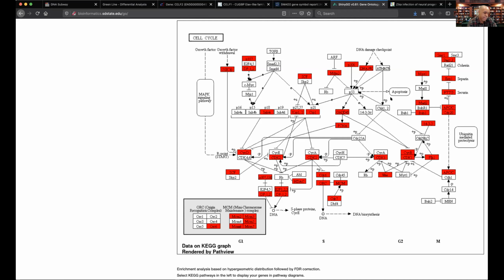Now, in the case of something like a viral infection, the trouble is that it's going to affect lots and lots of things in the cell. What you would hope, and then your work is kind of done, is that for a particular thing you're looking for, RNA-Seq maybe has a very narrow effect, just a few genes that it affects very significantly. But here it is pointing you in a direction.